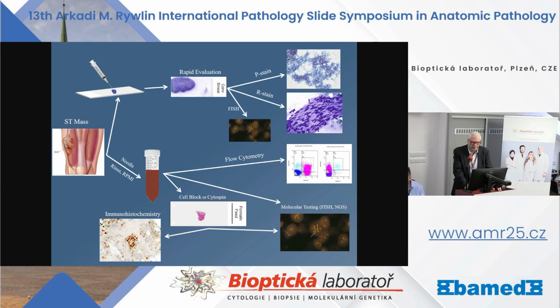So after we make our smears, and in my practice we use 2 stains, the Romanowsky-based stain, whether it's Giemsa, we use Diff-Quik in the United States, or May-Grunwald Giemsa, whatever you use here, as well as the Papanicolaou stain, because they give complementary images when you analyze the smears. We've even done fluorescent in situ hybridization from smears. Most of the time they're unstained smears, but we've done FNA. The other part is the needle rinse.